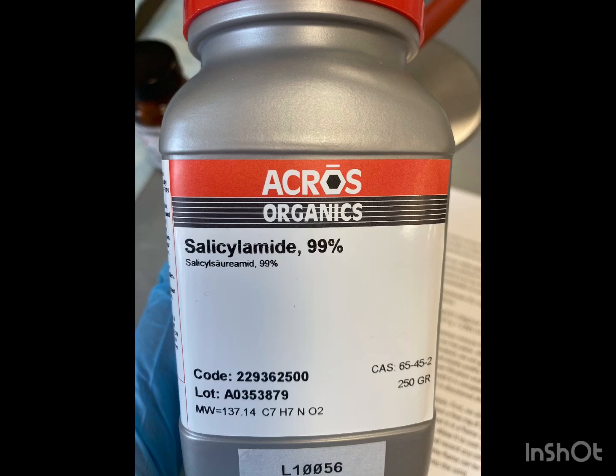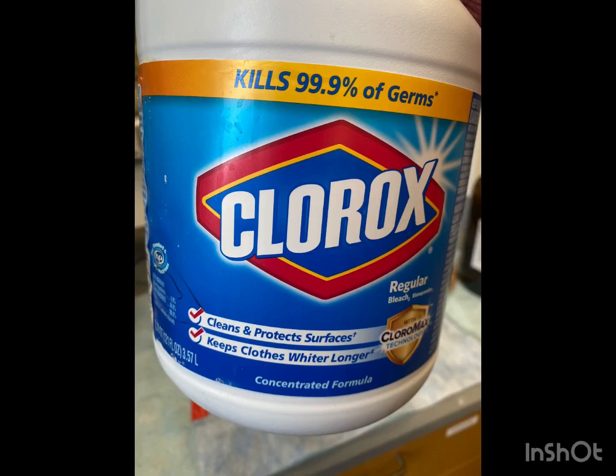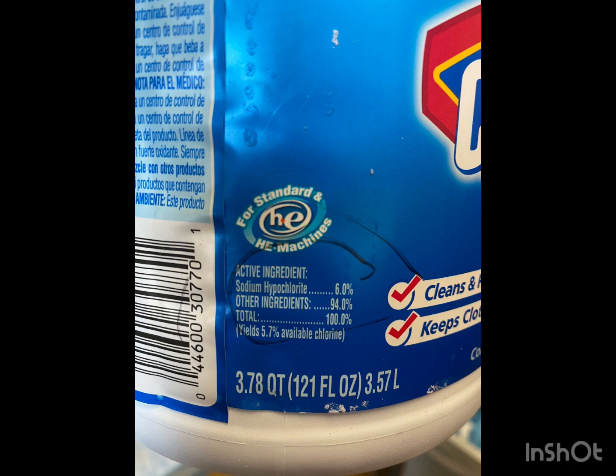Hello, my name is Krista Riggins and today we will be performing an electrophilic aromatic substitution with salicylamide as a substrate and the iodocation from sodium iodide and sodium hypochlorite as the electrophile.